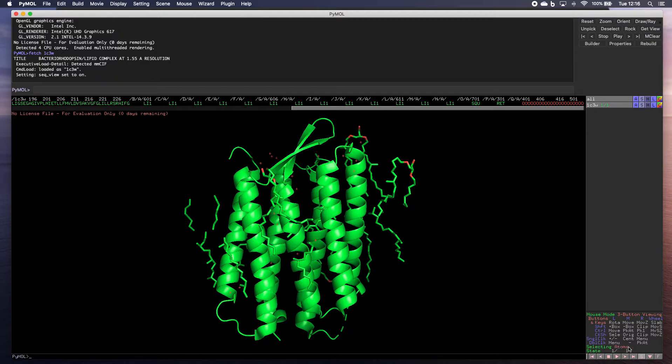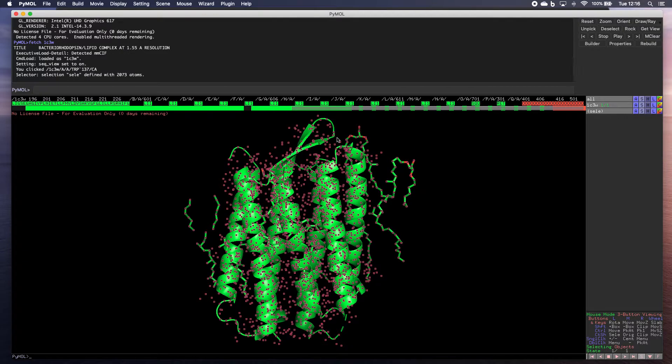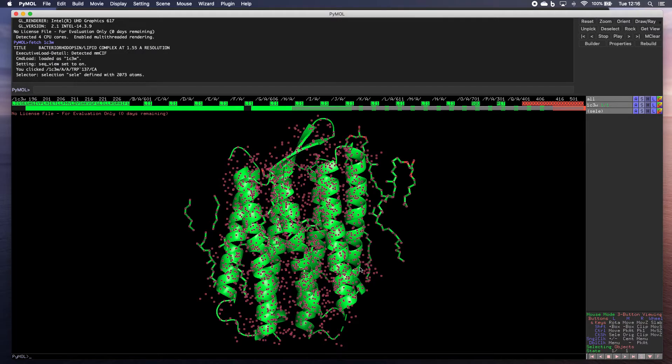So for example, if I click on objects, click on something here, everything gets selected. Because this, as far as Pymol is concerned, is one object.